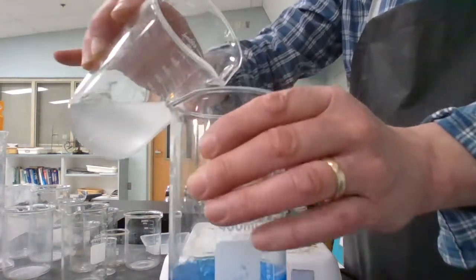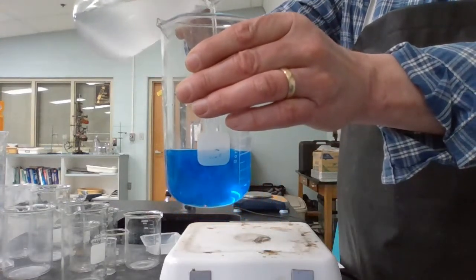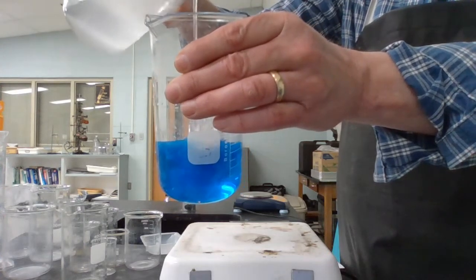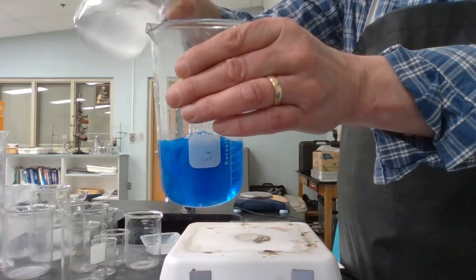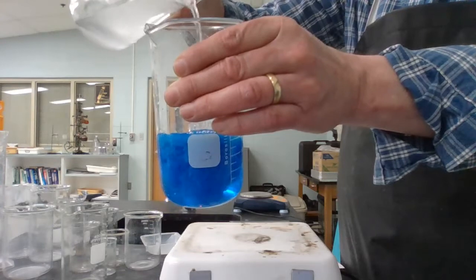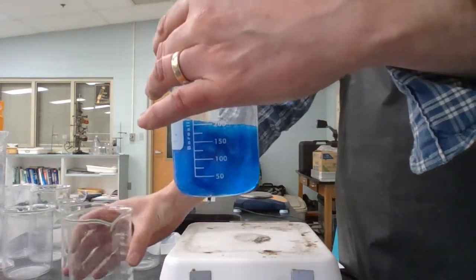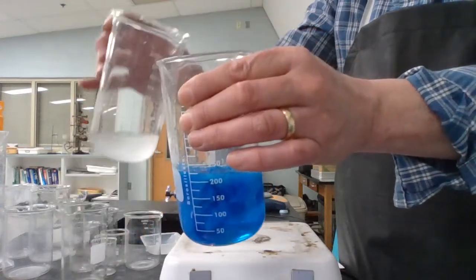We see that it's making it thicker, like a sludge in there.